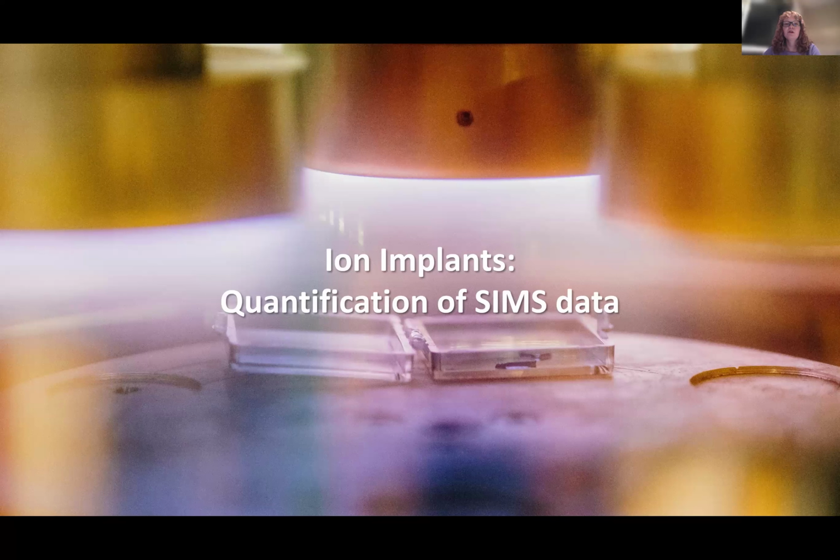And we run the appropriate reference alongside any of the data that we do. So we compare the matrix, whether it be carbon or silicon or gallium arsenide, we pick the appropriate reference and run it under exactly the same conditions on the same day to be able to analyze.